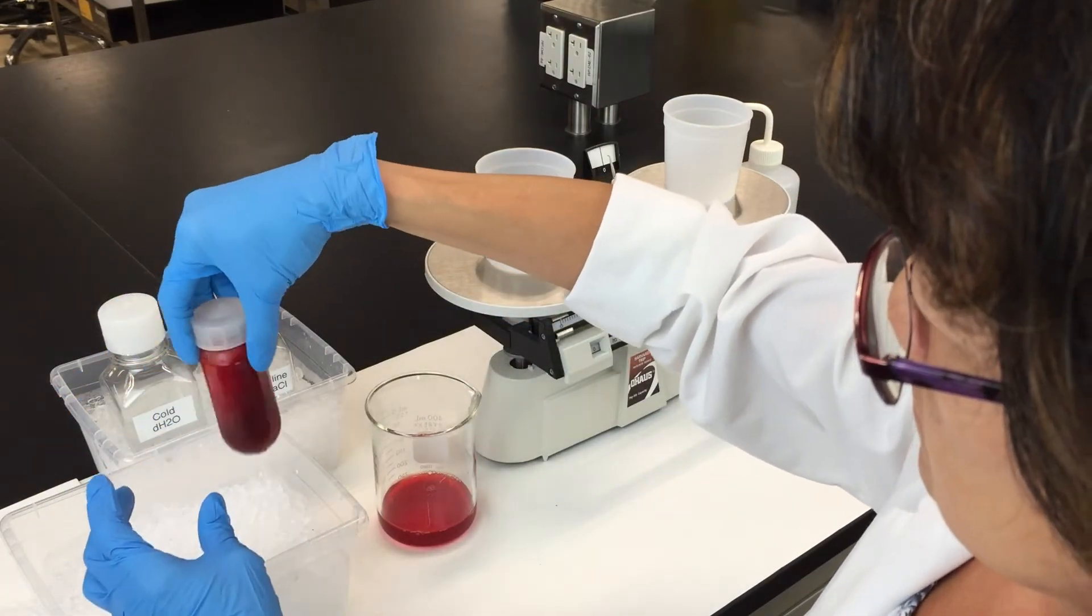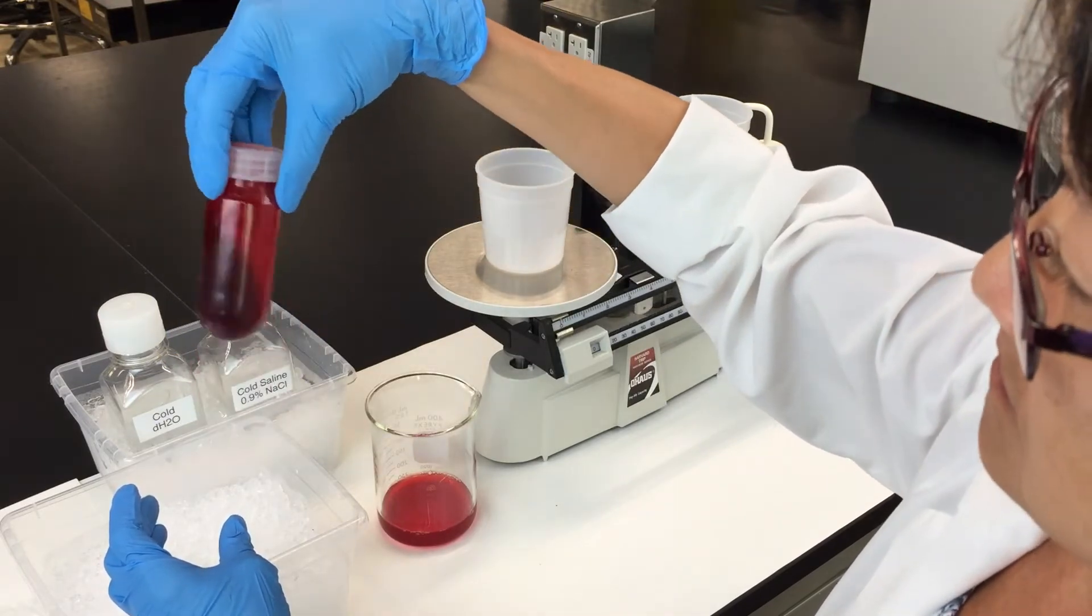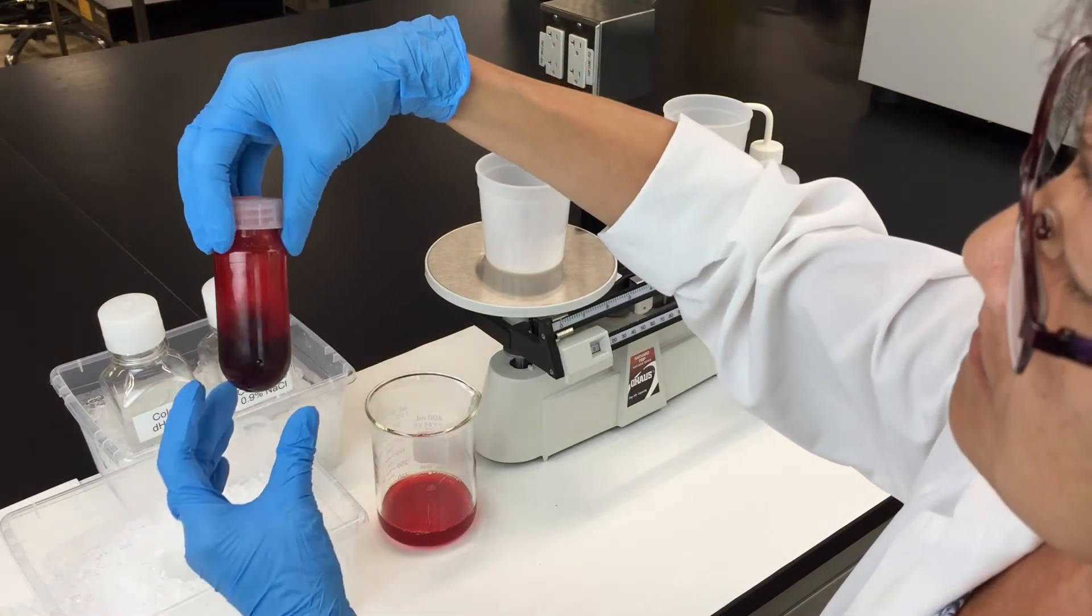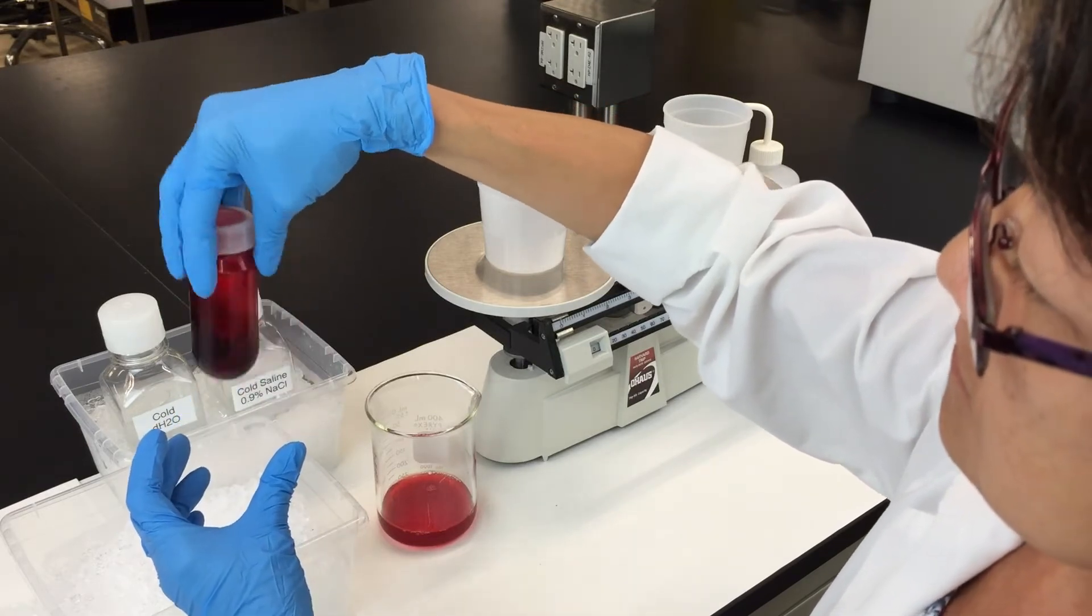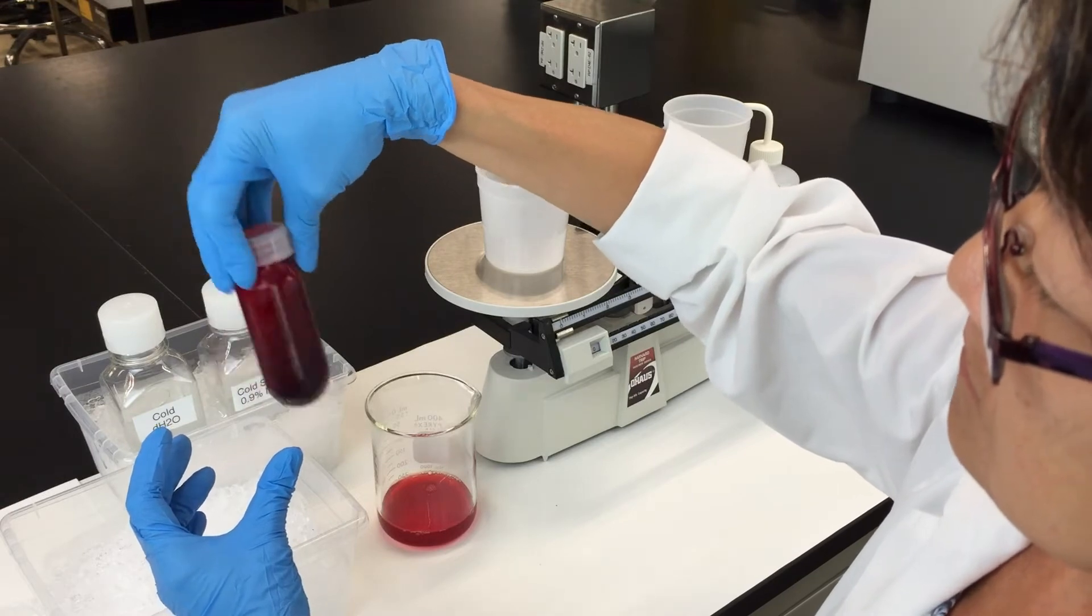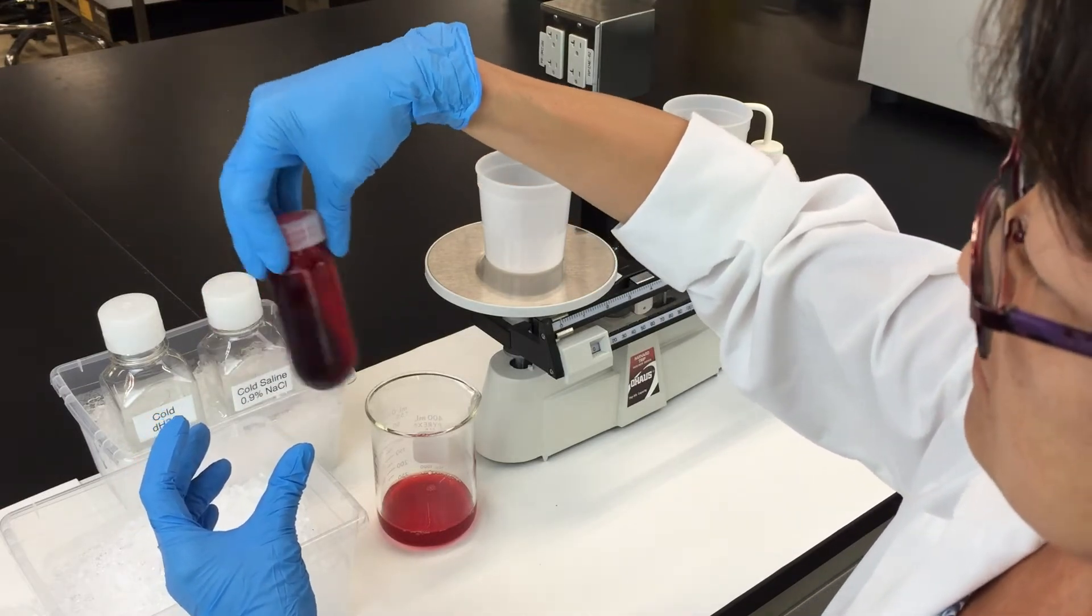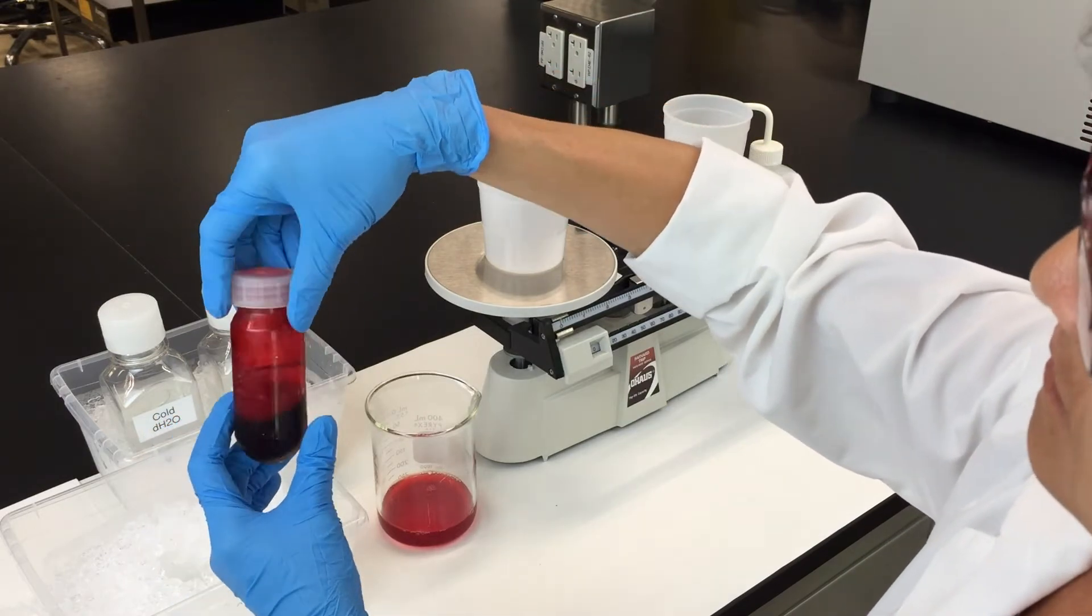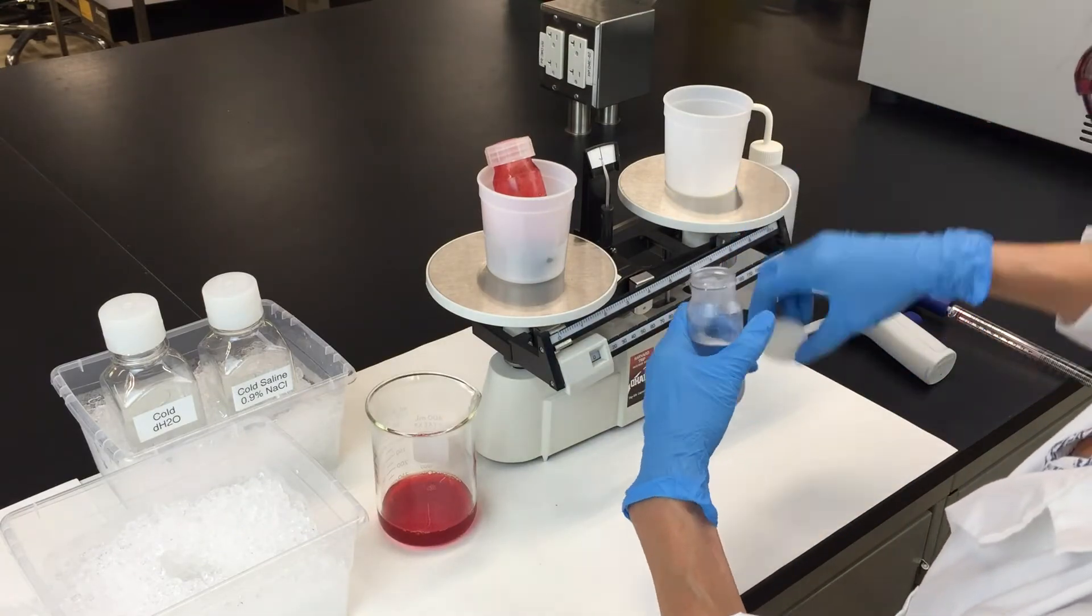Swirl the tube to re-suspend the pellet. You should see the solution turn from a bright red color to a dark red color as the red blood cells burst. Balance the tube and spin it down again.